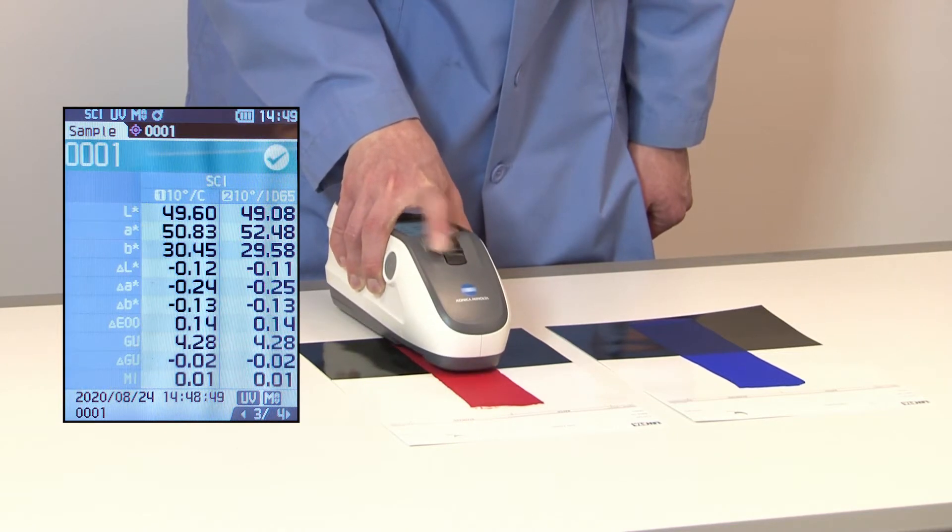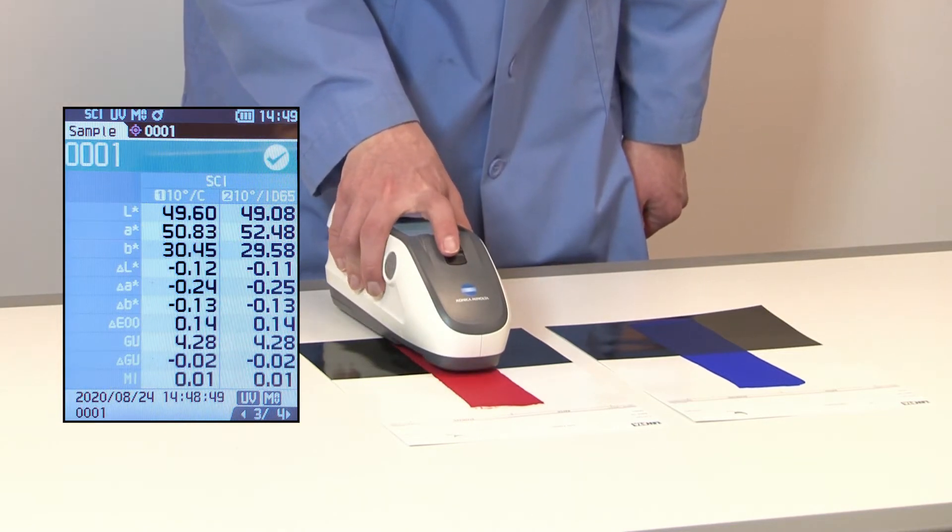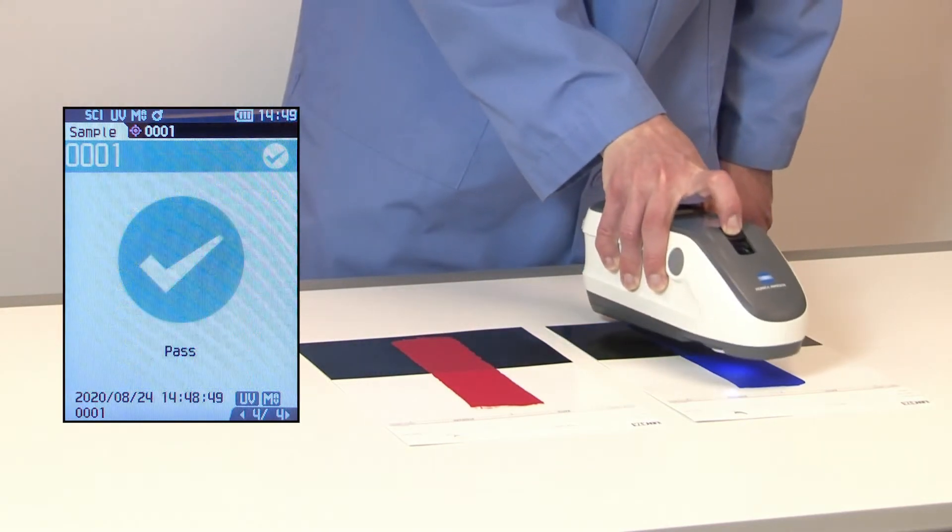To compare a sample against this new target, place the unit in sample mode, measure the object, and view the displayed numerical differences.